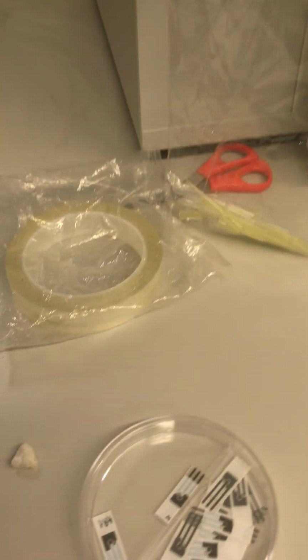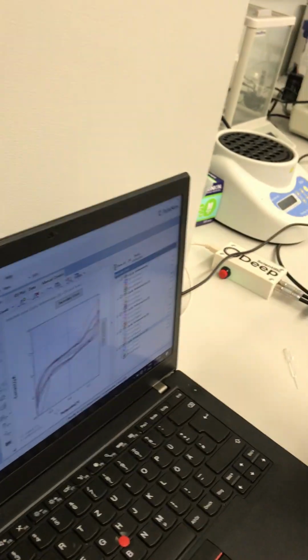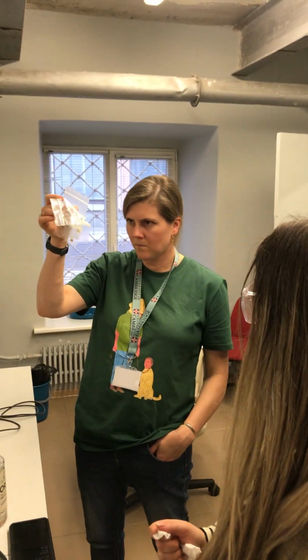And different electrodes are going to measure the same potential versus microamps, so it should be. The next step would be to repeat and measure more, deeper, some other properties. But then by the time, it might be evaporating, but it would still be okay. I think it should be okay.